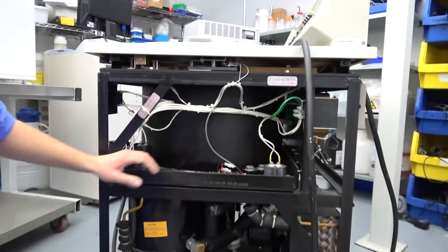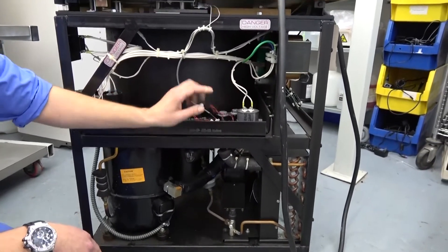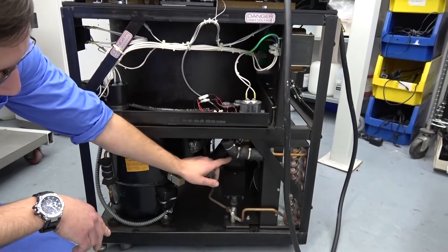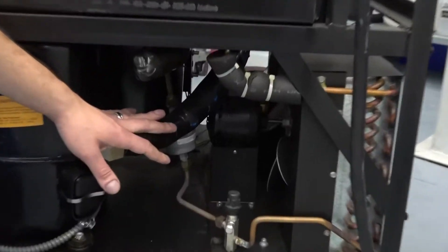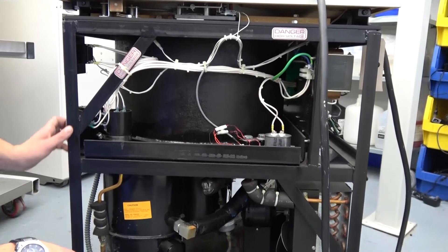Back to the side: we have wiring for the temperature probes, goes down and up. You've got your condenser, your fan, just your refrigeration lines, your power in, and power switch — simple stuff.